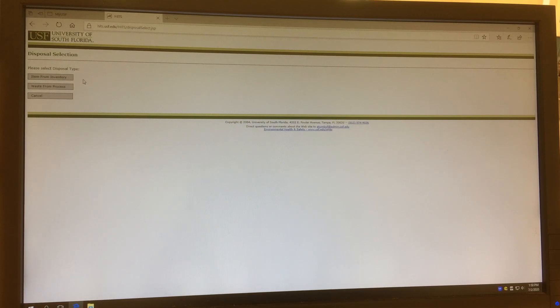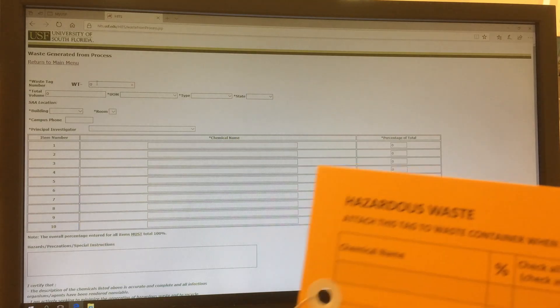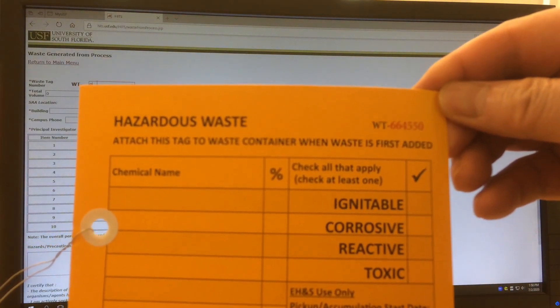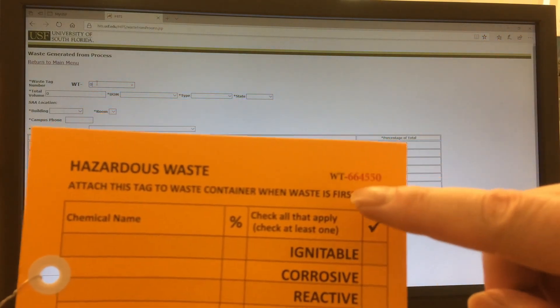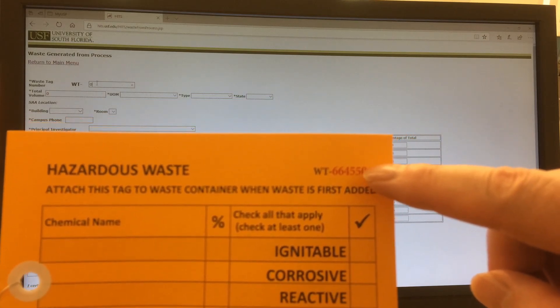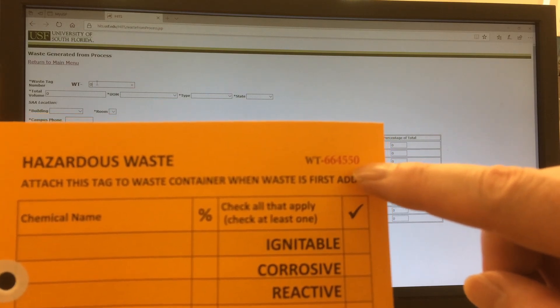Then click 'Waste From Process.' The Waste Tag Number is the number on this yellow tag you just filled out. For this instance, it is 664550.